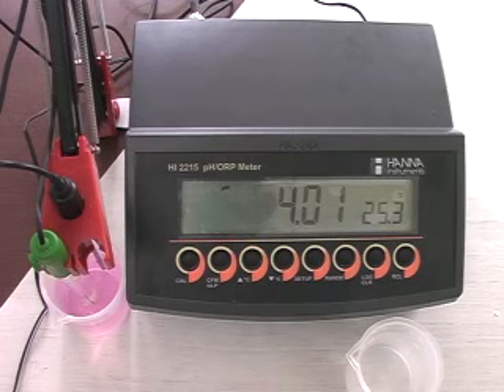Hello friends, welcome to our training video presented by HANA Equipments India Private Limited. This is K.S. Metcari and I am going to show you how to calibrate our bench pH meter, model number HI2215.